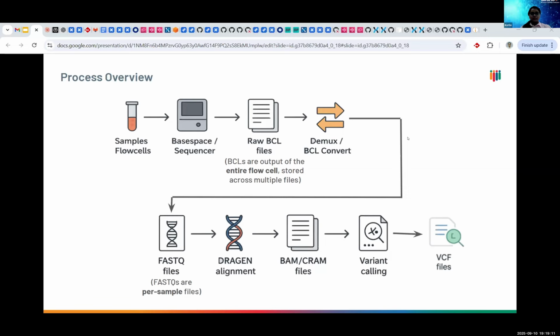Once we have the FASTQ files, we run an alignment step. So what does this alignment do? It takes all these reads and maps them against a reference genome so we can exactly see where each read belongs. Finally, the results of the alignment are stored in a format called CRAM. This is the version we keep for any downstream analysis of, say, variant calling, MRD detection, or tumor profiling, etc.